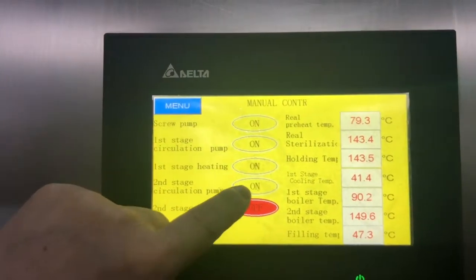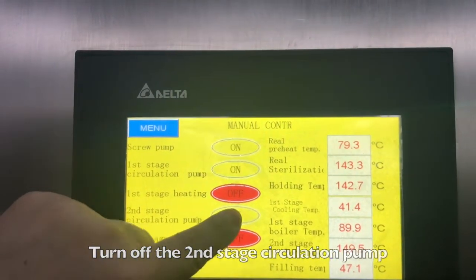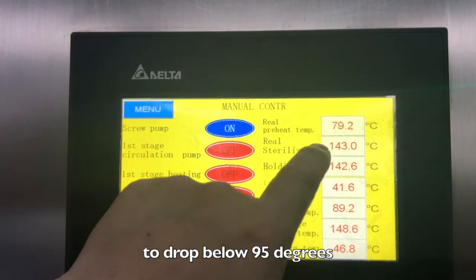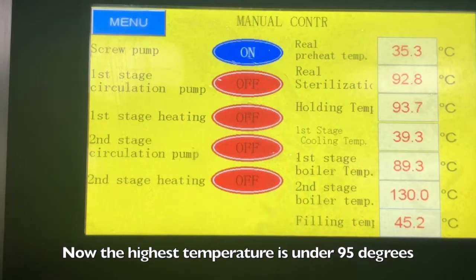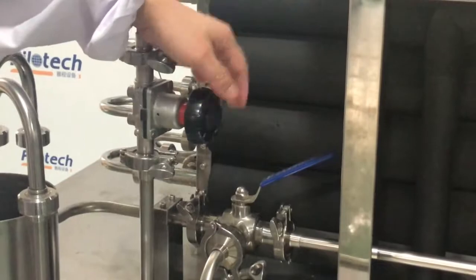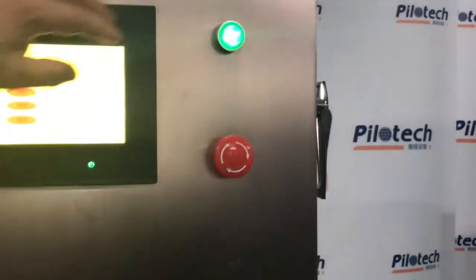Turn off the 2nd stage heating, then turn off the 1st stage heating. Turn off the 2nd stage circulation pump, then turn off the 1st stage circulation pump. Wait for the highest temperature in the pipelines to drop below 95 degrees. Once below 95 degrees, loosen the back pressure valve on the left. Turn off the screw pump. Turn off the touch screen.